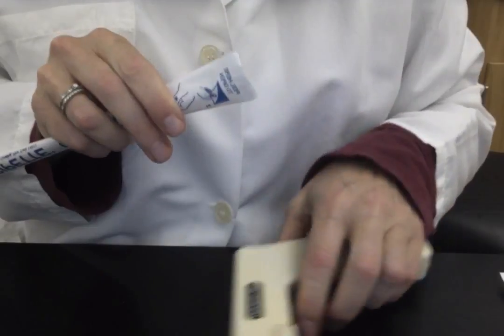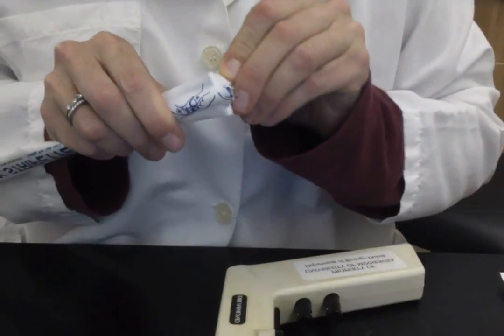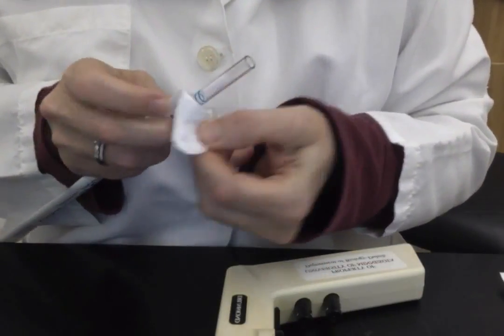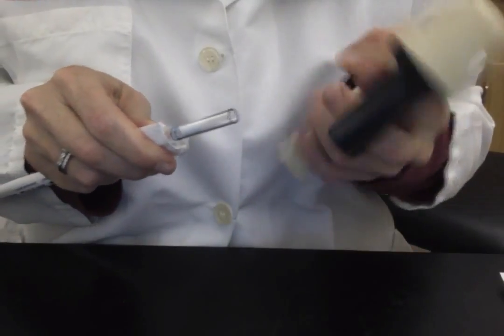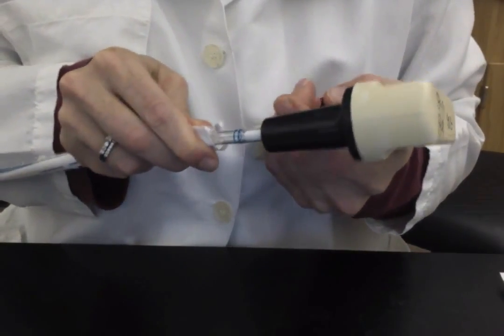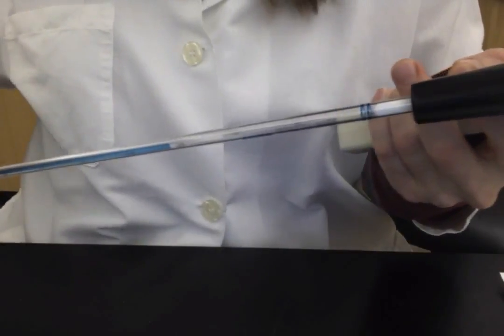When you open the pipette, you want to carefully press through the paper side, peel back, maintaining sterile technique, and then use some elbow grease to drive that pipette into the housing.